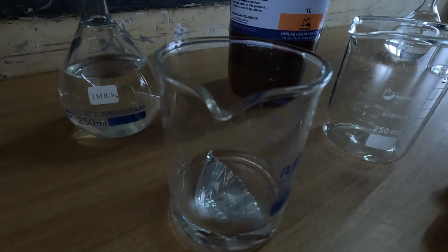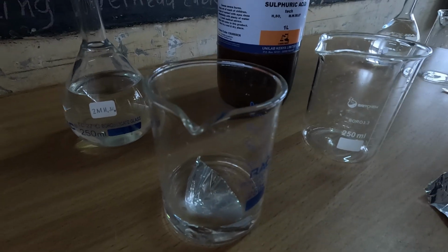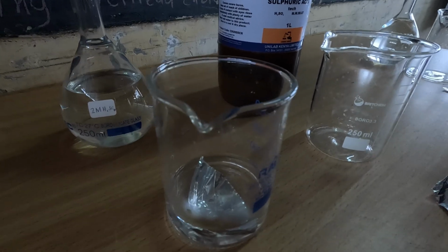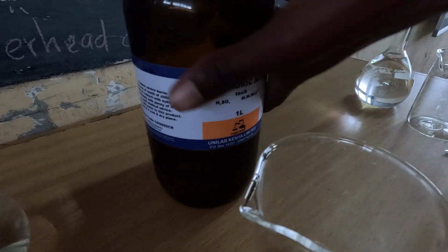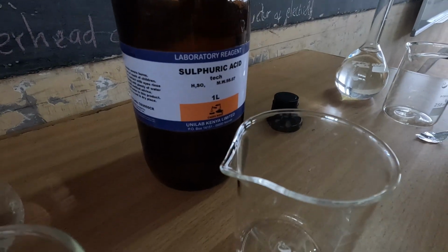But this aluminium is quite a strong reducing agent. Therefore, it can reduce sulfuric(VI) acid that is concentrated, which is with us here.